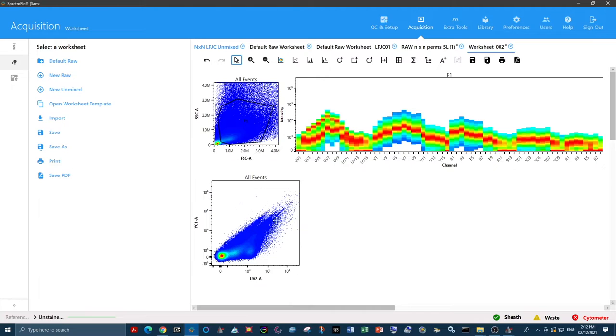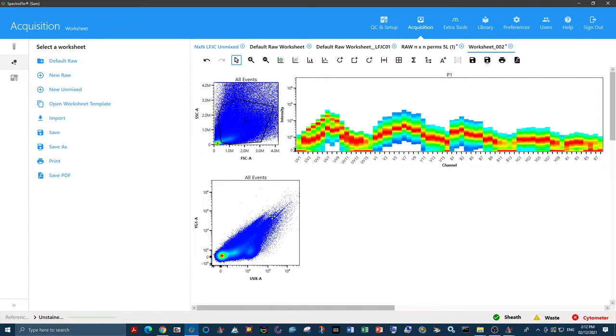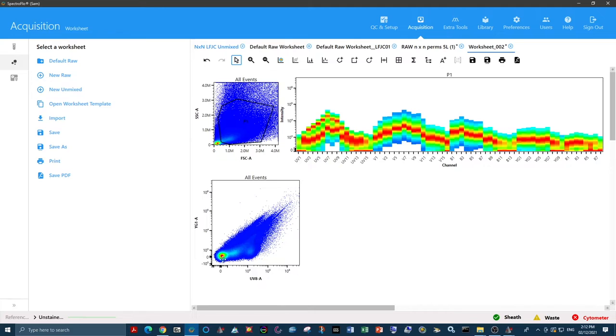The way it works is that anything on a diagonal line is generally the same spectral signature, just in varying levels of brightness. We're looking for shifts in only the x-axis or the y-axis to give a different population. This is looking like it might have four different populations.